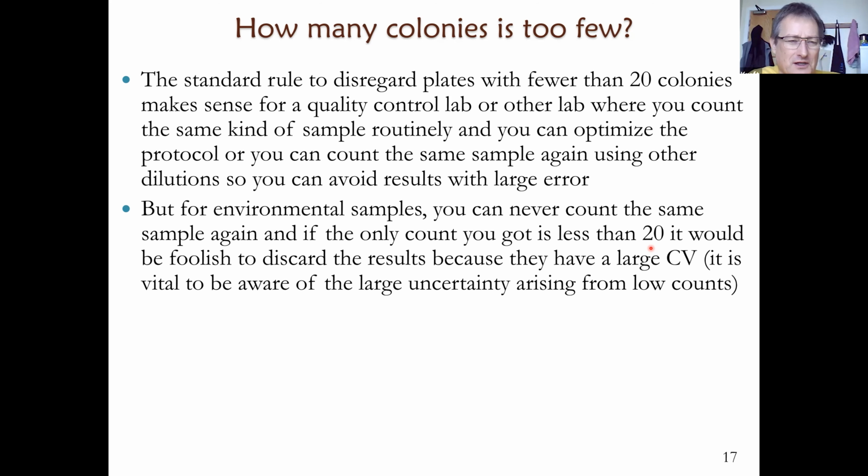So I just want you to be aware that averaging log counts and averaging counts is a very different thing. And if your counts vary over orders of magnitude, averaging the log counts is actually a sensible thing to do. So the arithmetic average of the log of the counts is a sensible thing to do. Just be aware that this is the same as a geometric mean of the actual counts.